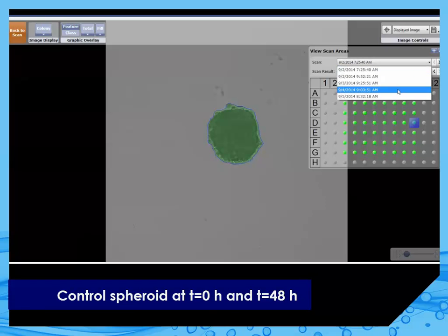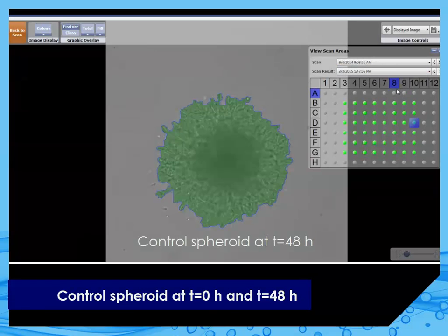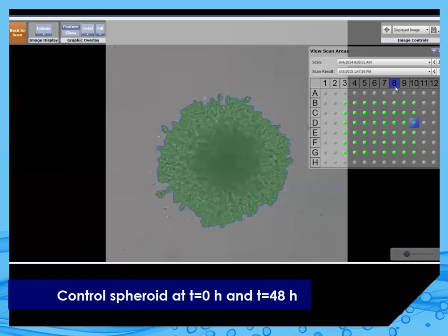Next, let us look at the same spheroid 48 hours later. The area occupied by the invading cells is much larger compared to time 0.